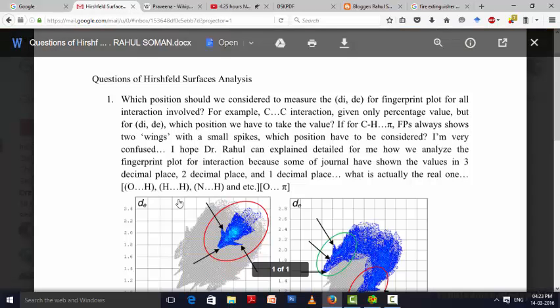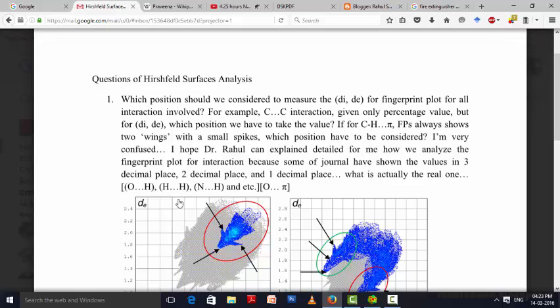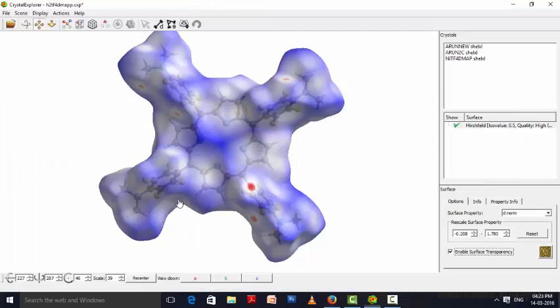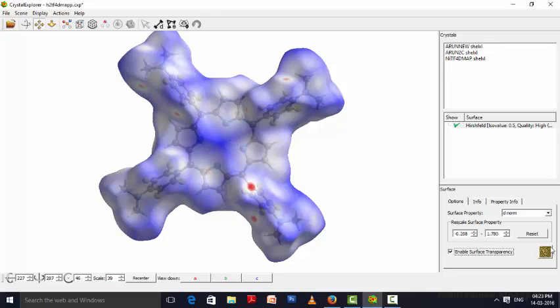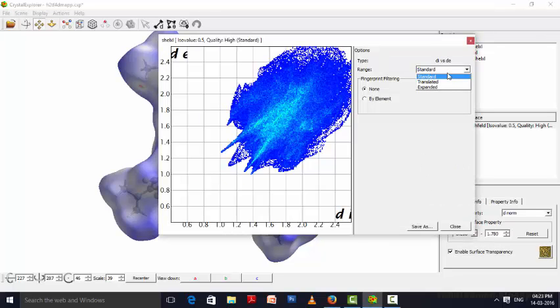These were your queries. First one: which position should we consider to measure the dI, dE for fingerprint plot for interactions involved? Actually, the question is not that clear to me, but I can show you how we can measure the dI and dE values in the Hirschfeld surface. For example, this is a Hirschfeld surface that I have generated from my molecule, and this is the fingerprint plot that I am getting.